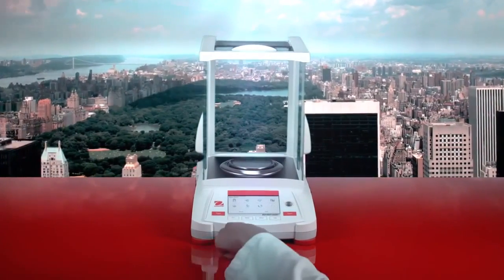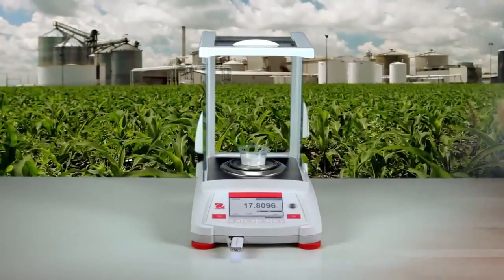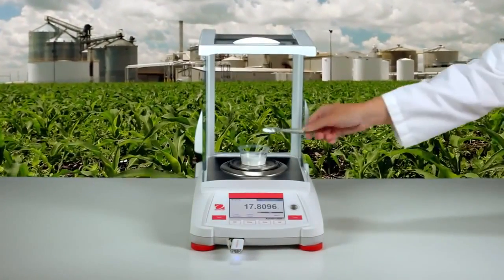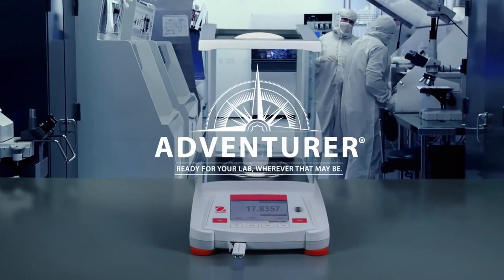A front USB port, a space-saving draft shield, and industry-leading performance. The all-new Adventurer — ready for your lab, wherever that may be.